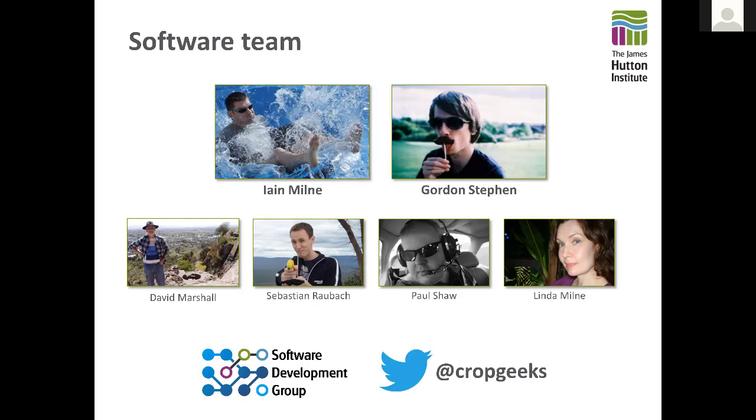So that's the team. Very quick overview of the kind of things that we've been developing. It's a wide range of visualization, database, analysis, and decision support tools, some of them going back 10, 15 years now, covering areas like sequencing, genotyping, phylogeny, and statistics. Probably primarily desktop-based tools, which is certainly the area I'm most comfortable with. One or two web-based tools. And more recently, some of the team have been branching out into mobile application development as well.